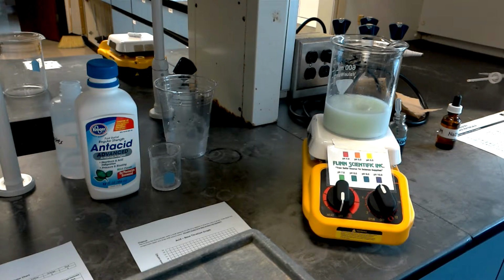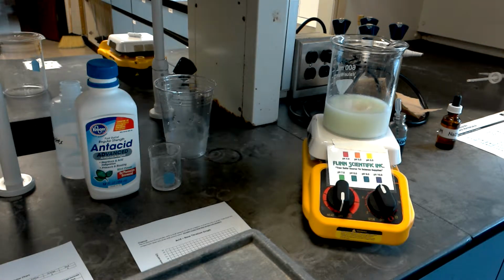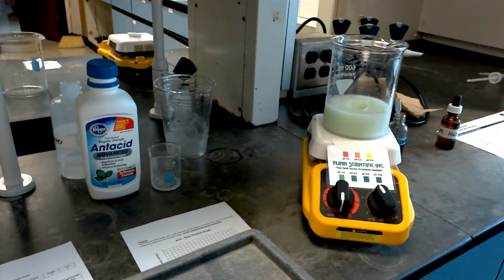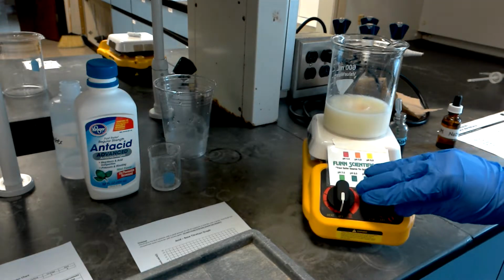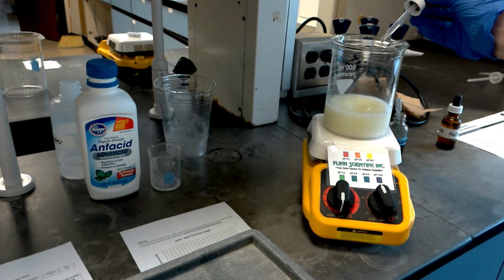24. 26 drops. See, there's a pink swirl in the middle there. Okay. 28 drops. Hopefully you can see that initial color and then the final color. 30 drops. Okay, we're definitely in the yellow, so you should have around 6 right now.